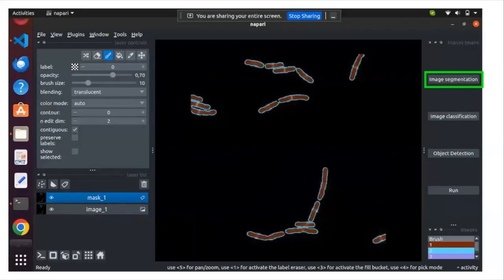For example, if you want to make a segmentation of bacteria, you can make some corrections by using the different pencils at the bottom right. You can brush, add class one, class two, or class three.